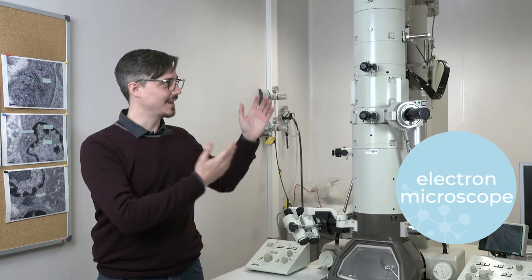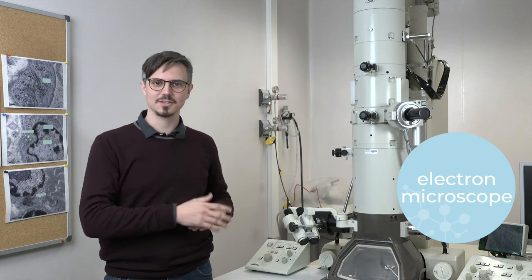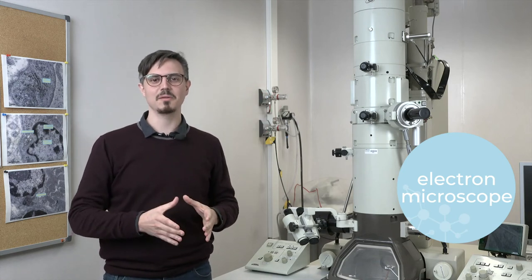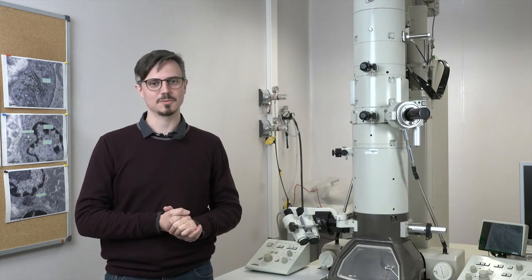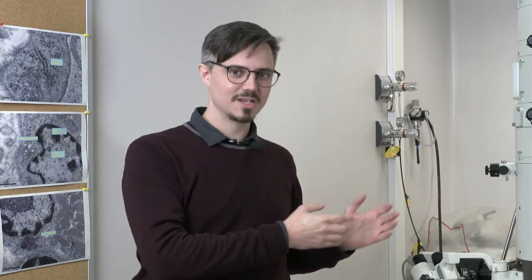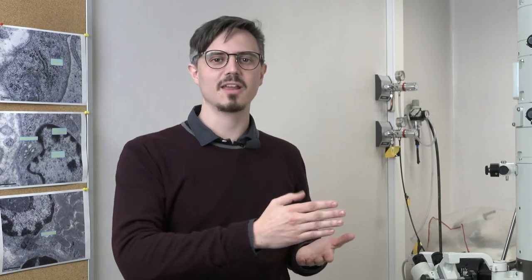Instead of photons, electron microscopes use electrons to generate an even more magnified image than the ones obtained with optical microscopes. Electron microscopes generate always grayscale images that can be colorized afterwards.